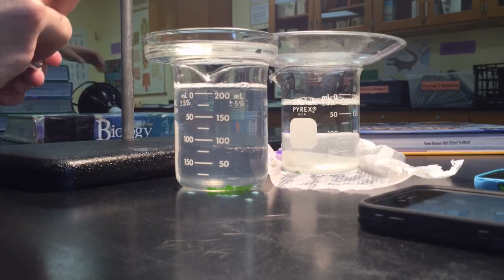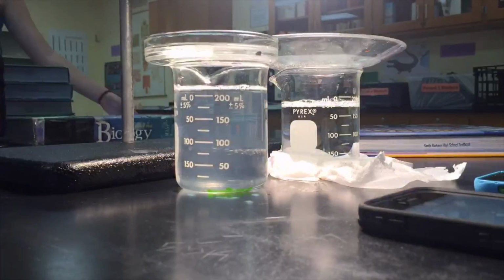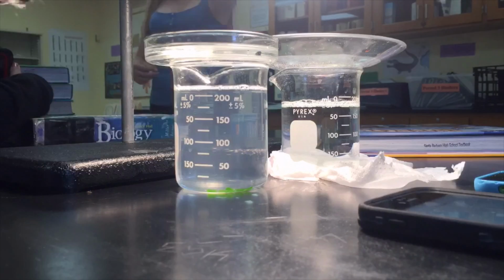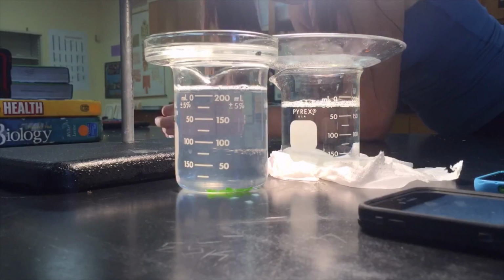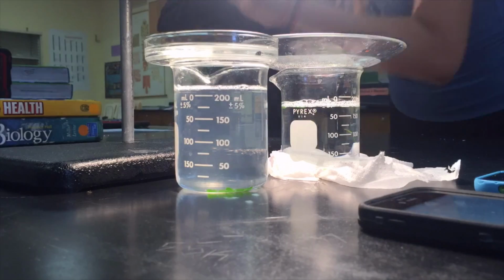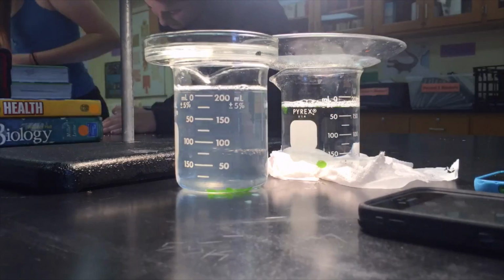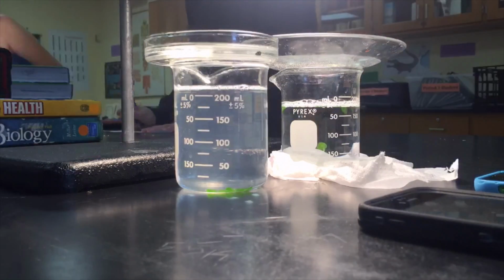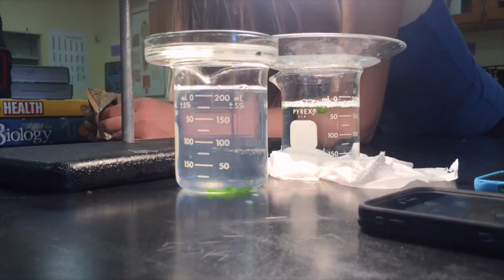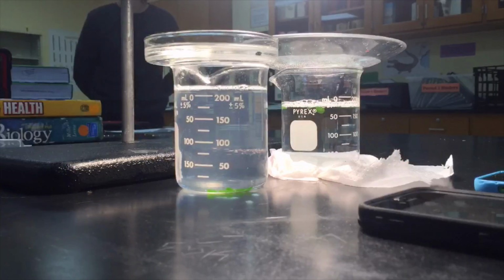These results can be explained by photosynthesis, which uses sunlight, water, and carbon dioxide to create sugar and, as a byproduct, creates oxygen. Because the leaves have been deoxygenized, they will begin to float once they complete photosynthesis and oxygen is released, thus oxygenizing them. Once they begin to float, we can mark that as a point at which photosynthesis has been completed. In samples with more baking soda, and thus more carbon available, we can see that the reaction occurs at a slightly faster rate to that of photosynthesis elsewhere.